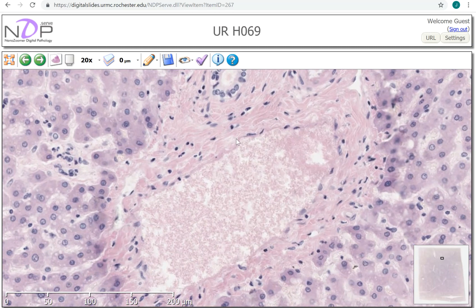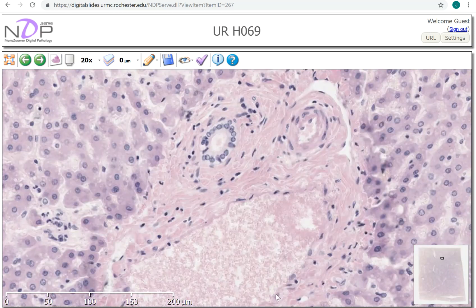Finally, the last important structure we can see down here is a much larger structure, and it doesn't have that thick muscular wall that we saw in the artery. This is the branch of the portal vein that we see in the portal triad.